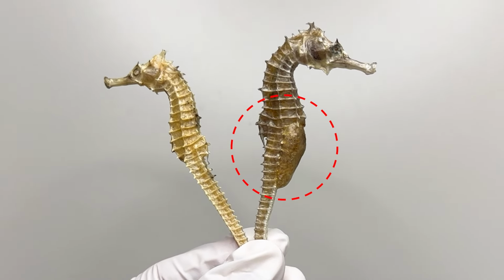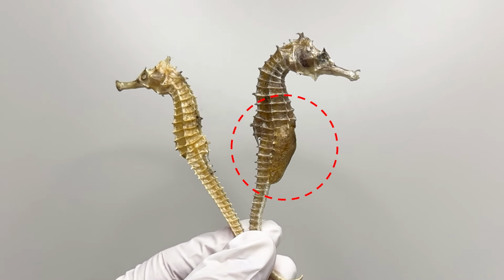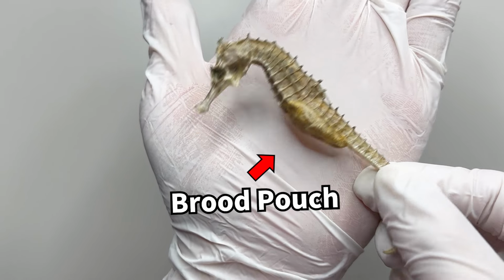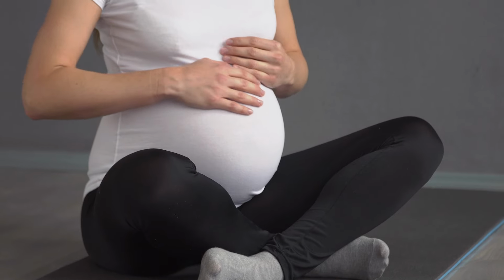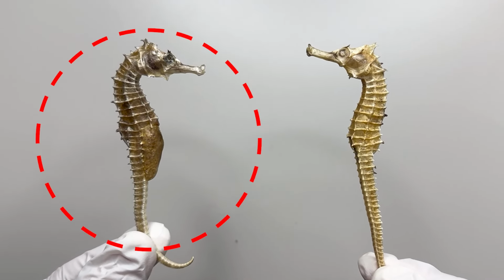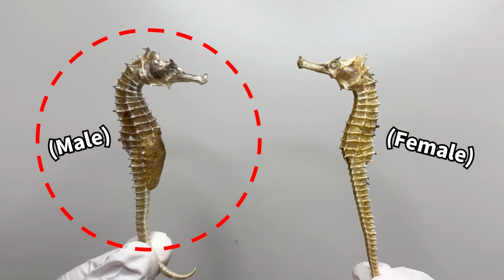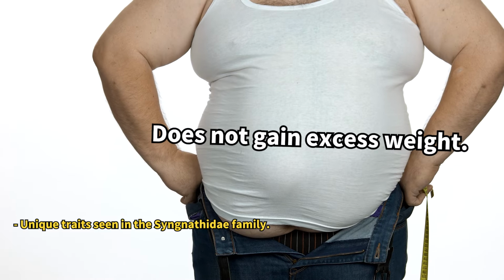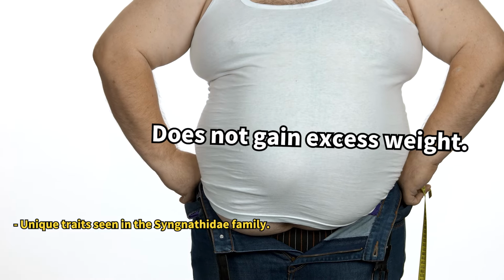Notice only one of these seahorses has a bulge at the bottom of its belly. This area, where seahorses carry their babies, is called the brood pouch. The surprising part is that the male seahorse has this brood pouch. Seahorses are the only animals in the world where males carry and give birth to the babies.